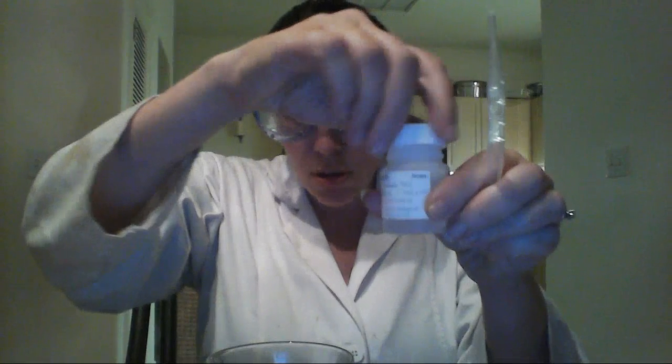So I'm going to go ahead, I'm going to just fill up my pipette with the ethanol. Again, you should be wearing gloves. I'm going to do this really, really quickly.